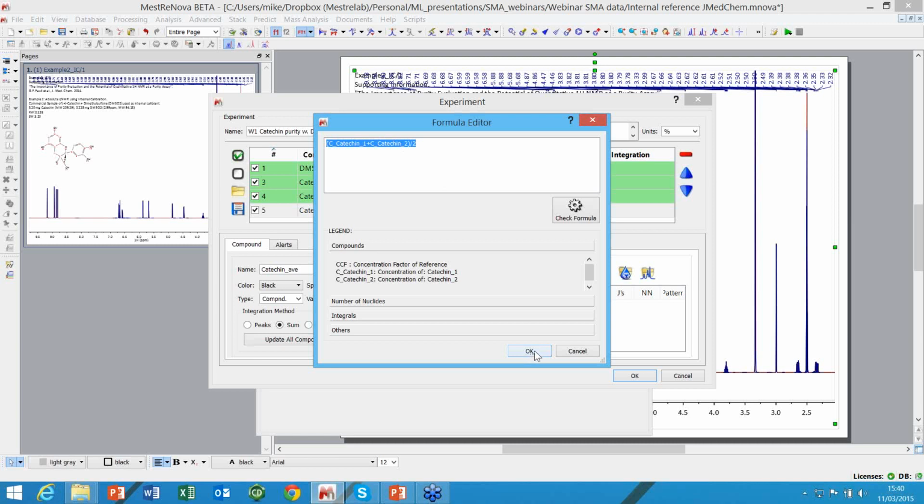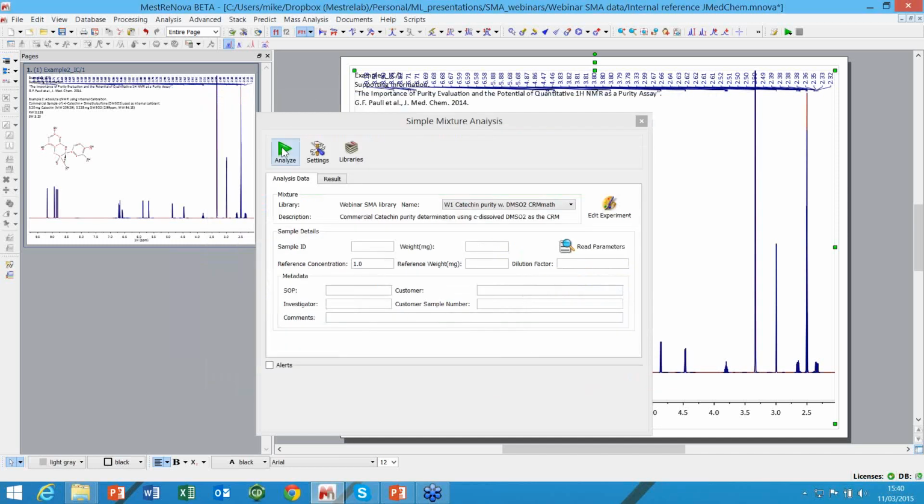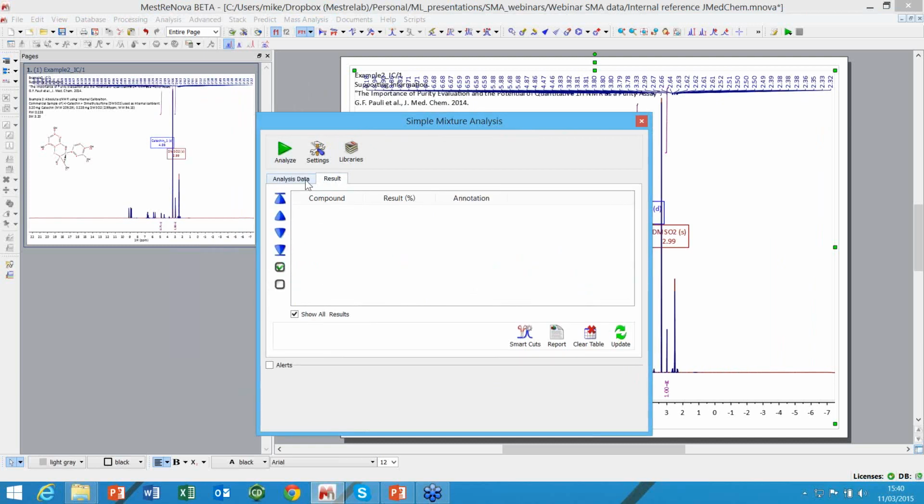That's just determining the average, and determining the RSD would be a more complicated equation that uses the values you saw in those maths functions. It looks a bit nasty, but it's not that bad. I don't have it in this experiment, but I can certainly describe how to set those up. So we can analyze with that and you'll see the results.